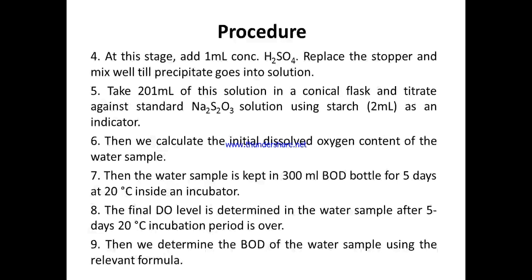ओके, now we add 1 milliliter of concentrated H2SO4. उसके बाद हम क्या करते हैं स्टूडेंट्स, we will add 1 milliliter of concentrated H2SO4. When I say concentrated, इसका मतलब स्ट्रॉन्ग एसिड है. आप जानते हैं ना, कंसनट्रेटेड और डाइल्यूटेड दो कैटेगरीज होती हैं. If it is concentrated it's a strong one. If it is diluted that means the strength has been reduced by diluting it with diluting agents. ठीक है ना. So we need to handle the acid very cautiously because it's a strong acid. Okay, it's a concentrated acid.